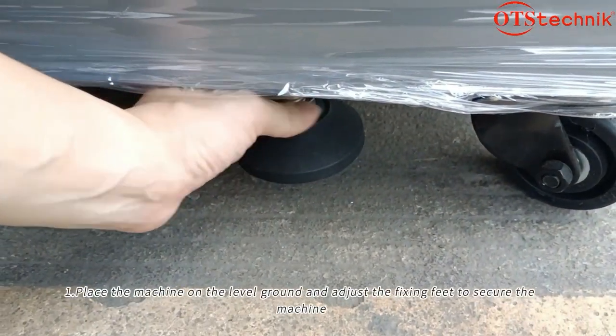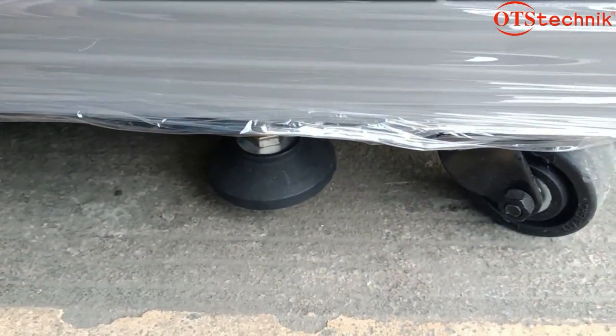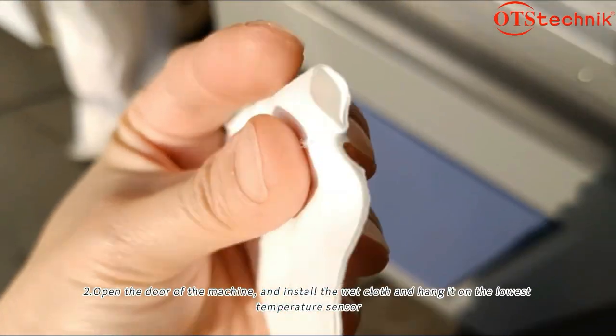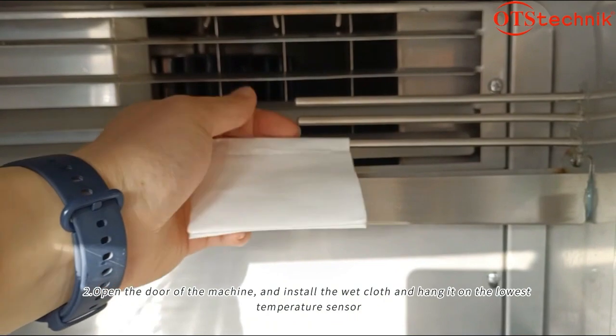Place the machine on level ground and adjust the fixing feet to secure the machine. Open the door of the machine and install the wet cloth, hanging it on the lowest temperature sensor.